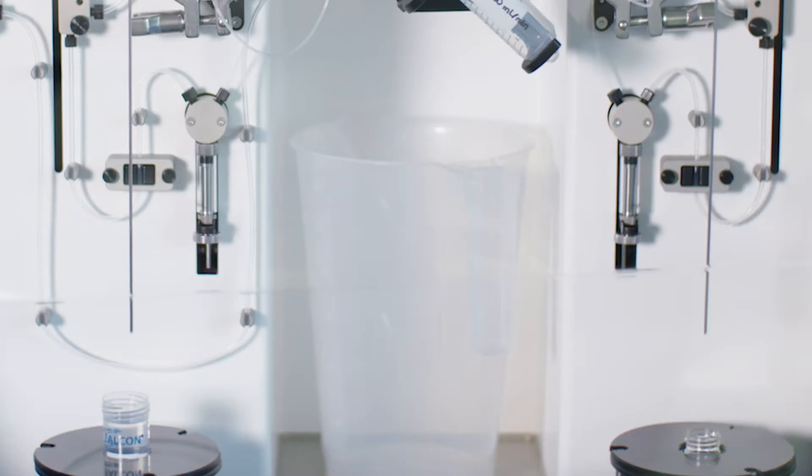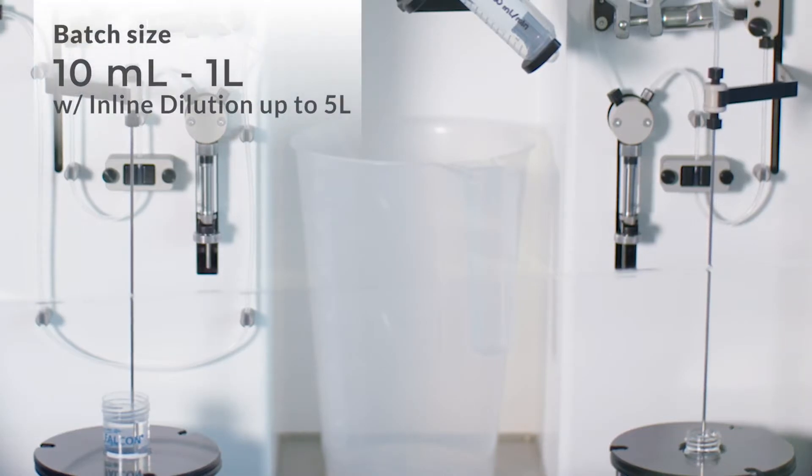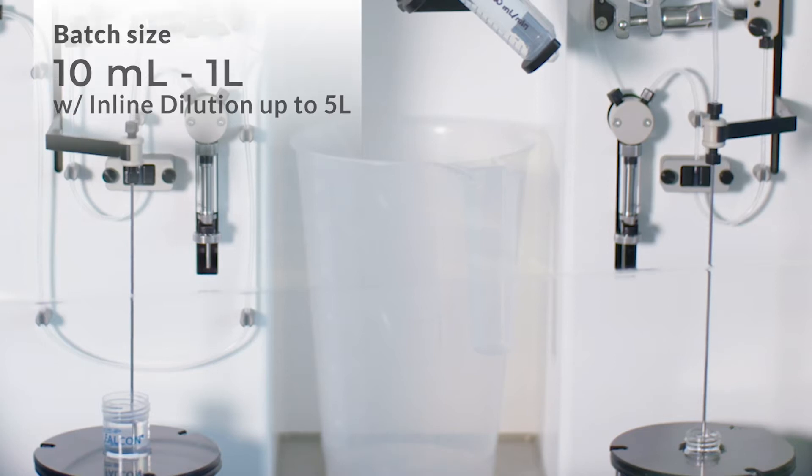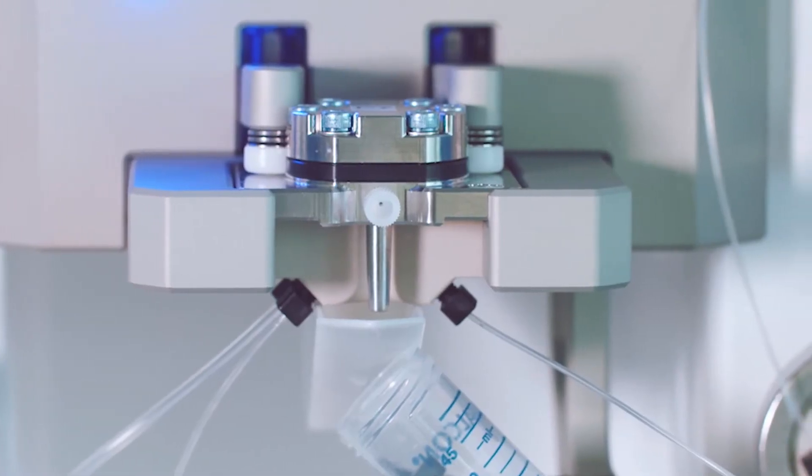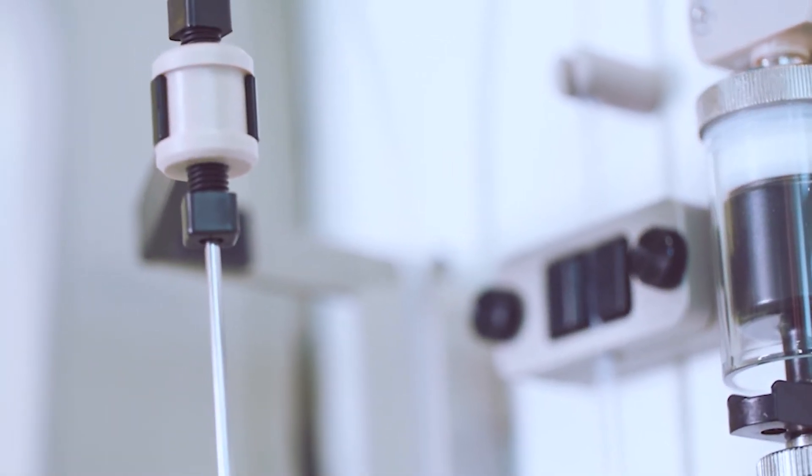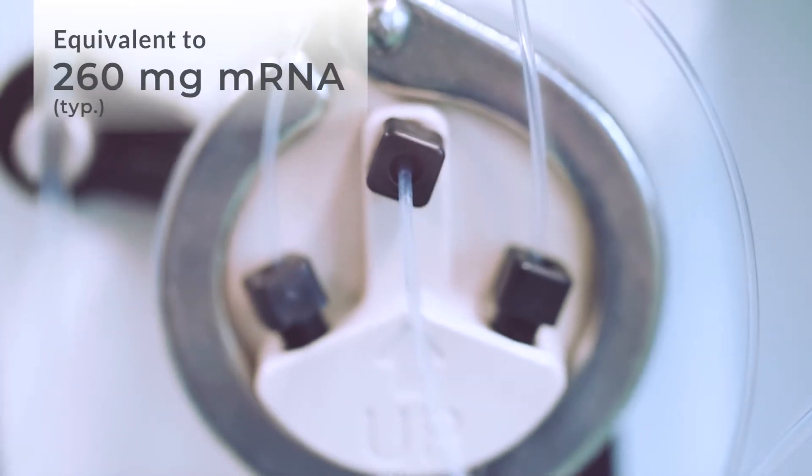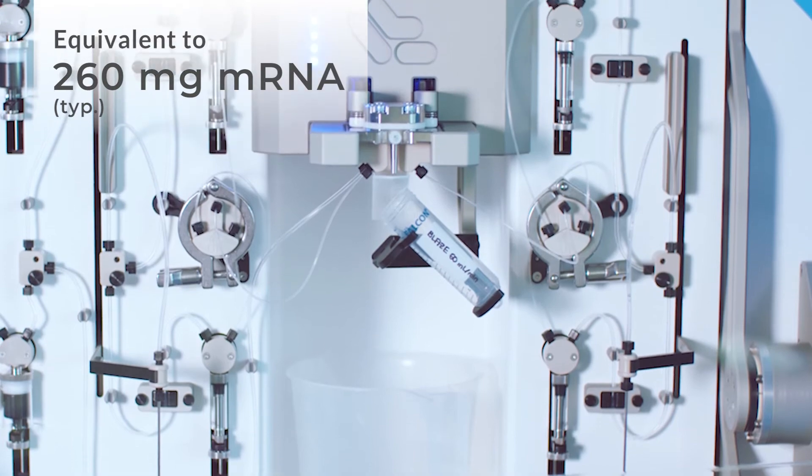You can easily scale your bench formulations up to one liter or combine two unit operations in one using inline dilution to make up to 5 liters of bulk nanoparticles. Such a formulation requires just over 10 minutes of formulation time and using typical formulation parameters is enough to encapsulate 260 mg of mRNA.